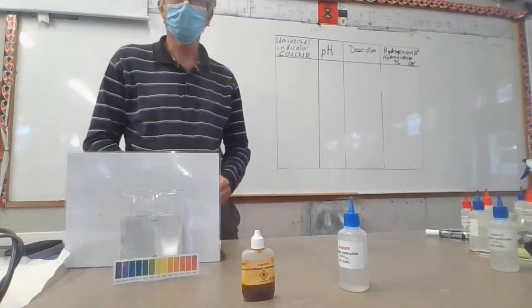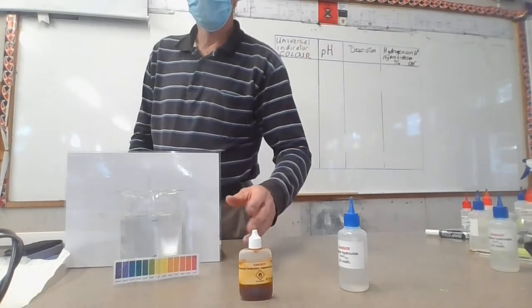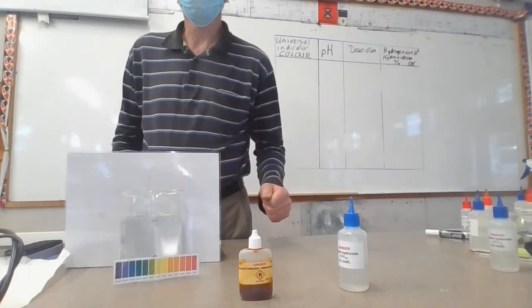This video is about the color changes that occur when we use universal indicator and we are neutralizing a solution in the beaker.